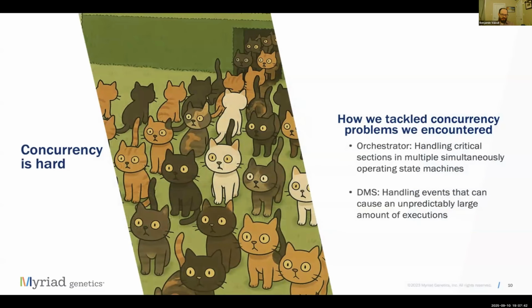Now I'm going to focus on two specific problems we encountered when scaling up our software systems for MRD. First in our orchestrator, and then one in the DMS.